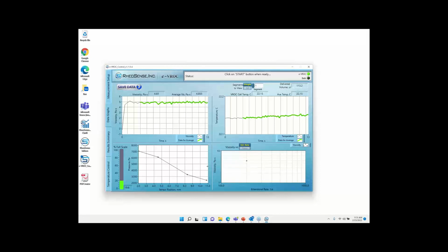If you're familiar with Reynolds number and the transition from laminar to turbulent flow, for the uniform channel that transition Reynolds number is going to be somewhere around 2,500. It varies a little bit depending on the source, but ballpark 2,300 to 2,500. For the extensional chip, it tends to be more in practice 10 to 20, a couple of orders of magnitude lower.